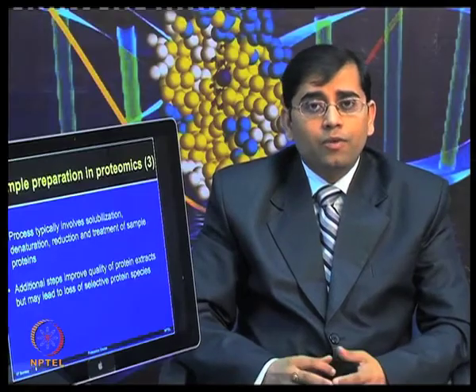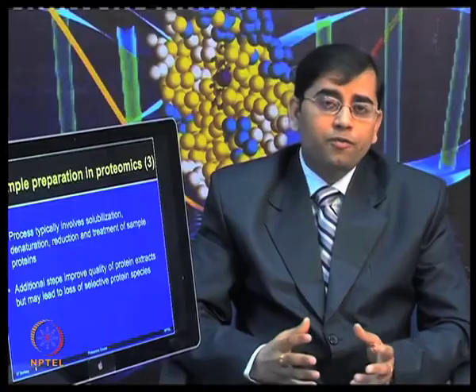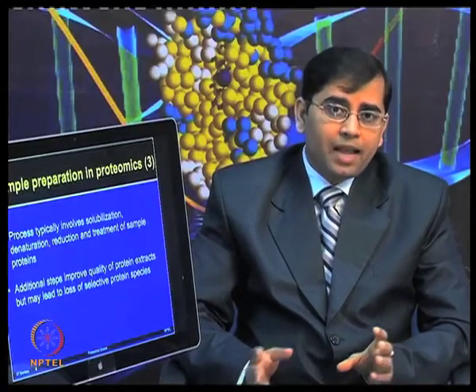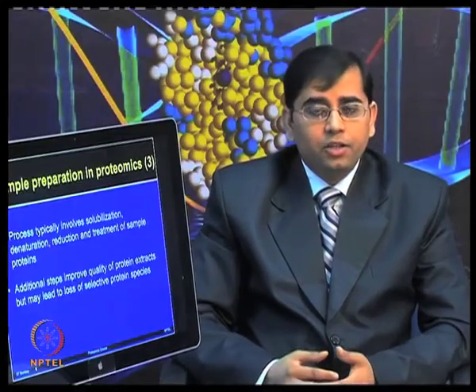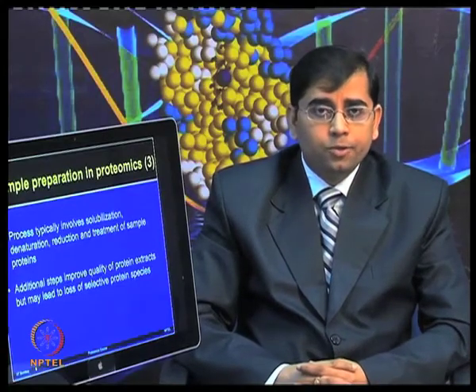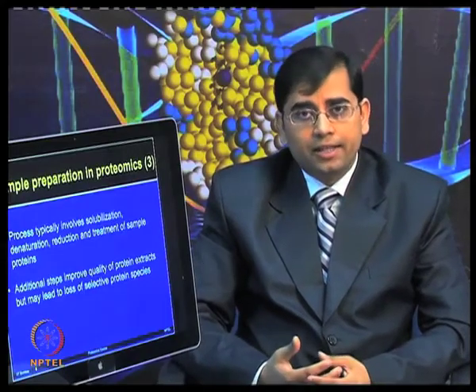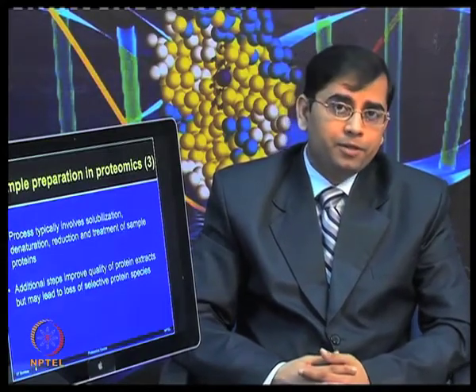And while you are doing this, you have to be very cautious that when you are performing various steps and sequential types of extraction, you may also lose a small fraction of the proteins. So, one has to be careful when adding various additional steps during the sample preparation.